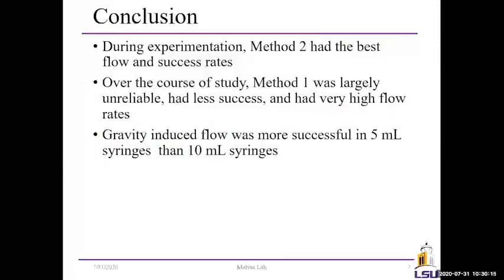So in conclusion, method 2 has the best flow and success rates, with on-target flow rates and a very good standalone system for 24 hours. Method 1 was largely unreliable and had much higher flow rates than we needed, making it not a good fit for this study. And for our comparison of different variables that we studied, the gravity-induced flow was far more successful in 5 milliliter syringes than 10 milliliter syringes.